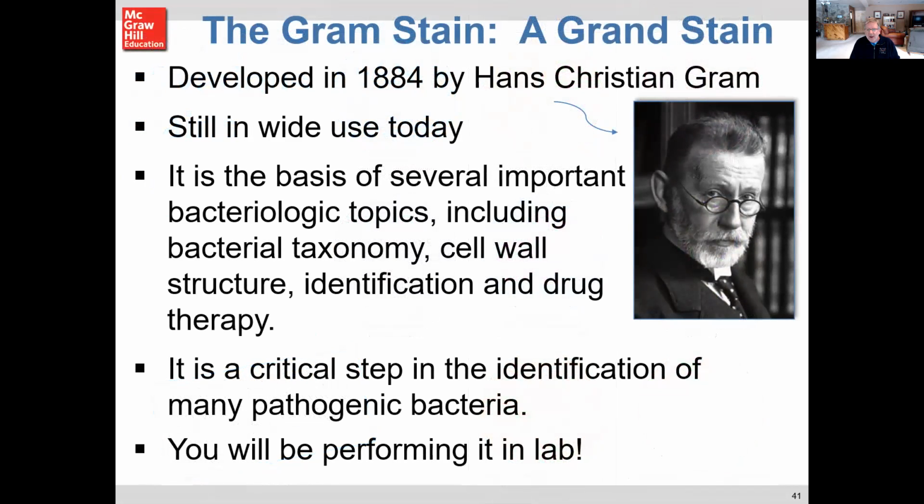Well, let's talk about the gram stain, because it is used today, even though it was developed 140 years ago by Hans Christian Gram, another microbiologist. It is a really important stain that all microbiology students perform. It is certainly one that you're going to be doing on your unknown coming up in another couple of months. It's going to go a long way to begin to narrow down the identification of your unknown bacteria into what's called the gram-positive group or the gram-negative group.